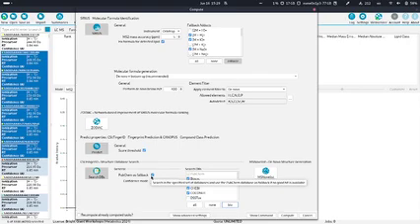And I might be able to show you an example also of how it looks, because you will also then have a box which says that in fallback mode, we also search in PubChem. I just want to emphasize, because I think it's a small feature, but it's really an important feature, because it's a fully automated check if the top hits you get when you search in a bio database make sense or not. And if it doesn't make sense, it then switches to PubChem automatically.